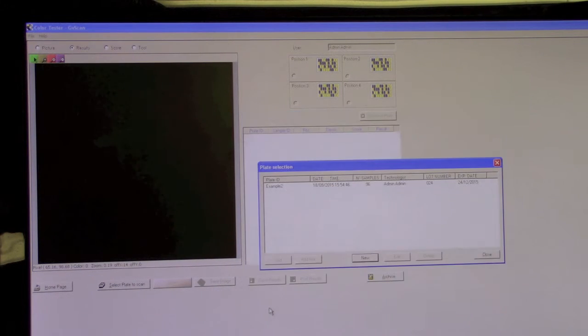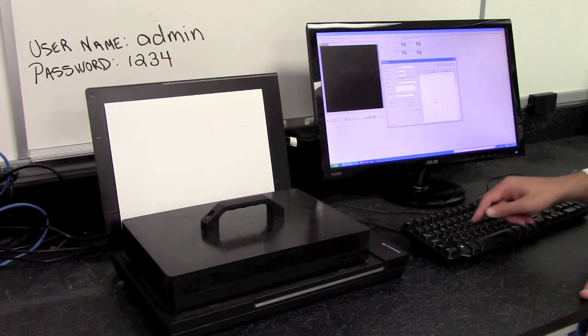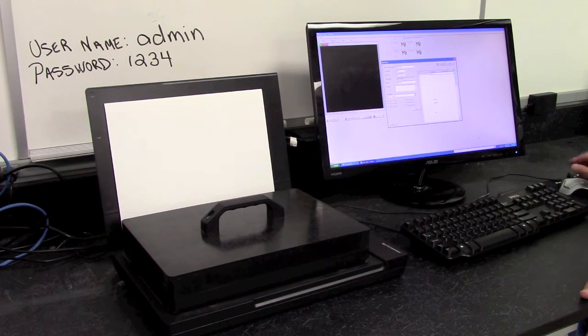If you were not running a complete plate, so you were only running a certain number of tests, you can select, I'm running tests from A1 through H2, so you can pretty much select any type of data here on the plate to identify your samples. So we'll go back in and put in our farm sample and a cow.